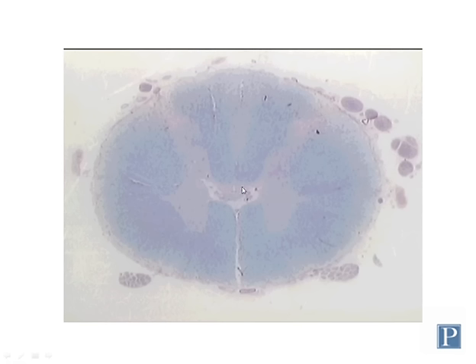It has several parts to it, or horns, that you need to know. So here, on these projections of gray matter on the posterior or dorsal side of the spinal cord, these are called the dorsal horns or posterior horns. Either of those terms is correct. Note that the posterior horns come all the way to the surface of the spinal cord.